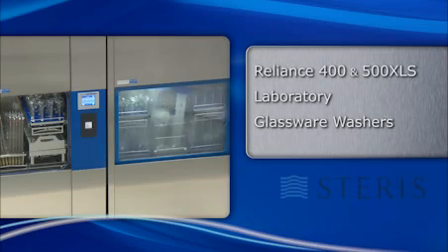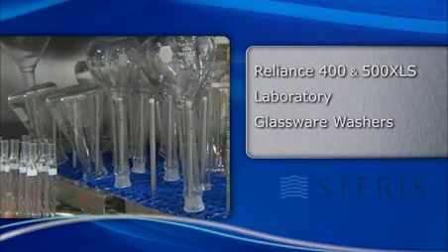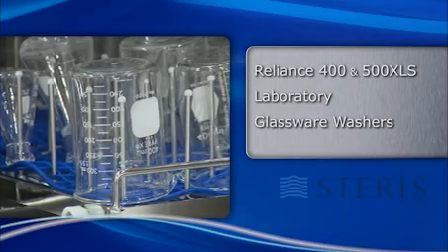The Reliance 400 and 500 XLS washers are a highly efficient and complete solution that can handle any laboratory glassware cleaning and drying challenges in your research facility.